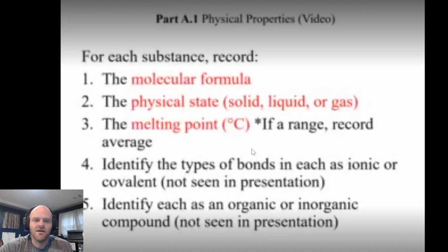But some of these organic compounds you're not going to be familiar with, and I'm not even familiar with to a large extent, so you have to look them up. And that's all we do here. We look up the compounds in lab on safety data sheets, and we're required to keep those to know how to treat chemical burns or toxic, if anything's toxic or whatever, or if something's flammable. So it's important for us to have this information handy when you're in the lab.